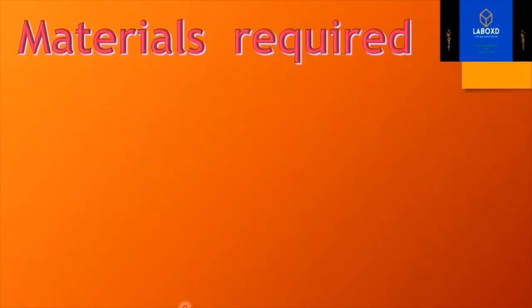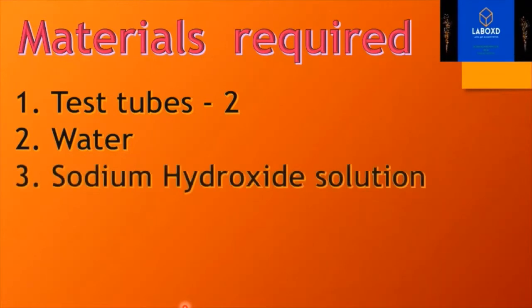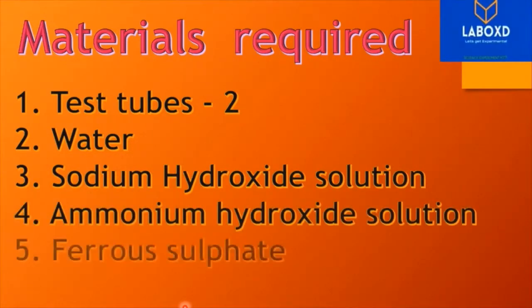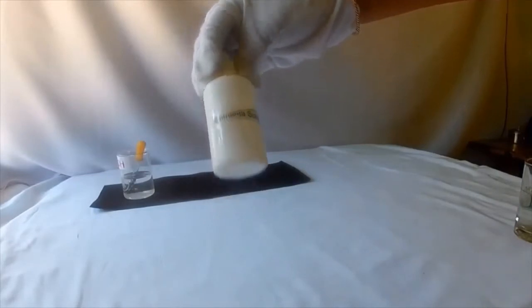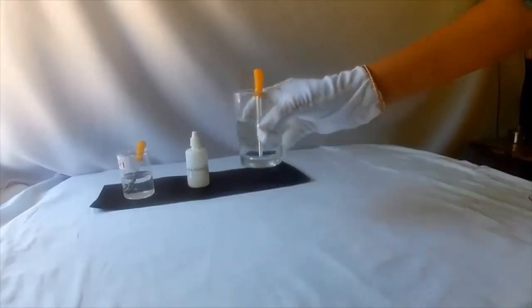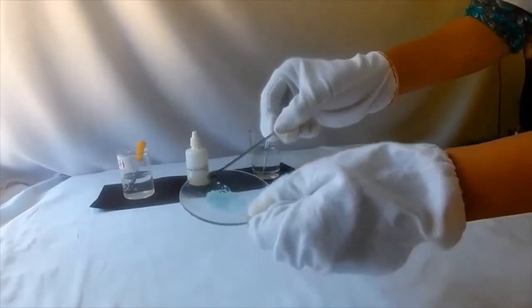The materials required for this experiment are 2 test tubes, water, sodium hydroxide solution, ammonium hydroxide solution, and ferrous sulphate. Take sodium hydroxide solution, ammonia solution, water, and ferrous sulphate salt. It is a light green salt.